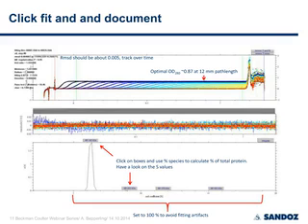You also should have a look at the S values to see if those values make sense, and also to check, especially for smaller proteins, it's not that trivial if it's dimer, trimer, and so on, because the fitted mass is of course dominated by the frictional ratio of the monomer.